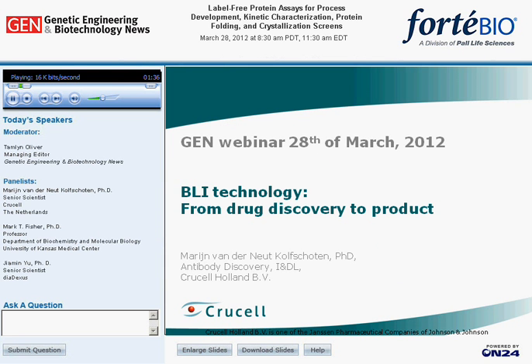In this webinar, I would like to present some examples on how the Octet supports the research activities within the Antibody Discovery Department of Crucell. Next slide.